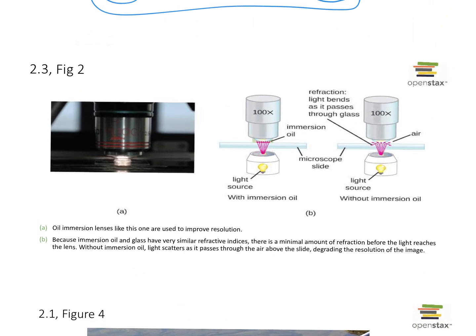It's not really bending. But the same thing happens when light is traveling through different mediums in a microscope. I'm not crazy about this picture. Let's say this is maybe the 4x objective, because when you're using that scanning power objective, that's the shortest one. You have your light source underneath the stage, and when the light travels up, your cells are going to be on your slide, probably right here, and the light's traveling up through the slide, and then it hits the air. That light is going to bend out in all different directions. It's really going to refract a lot.